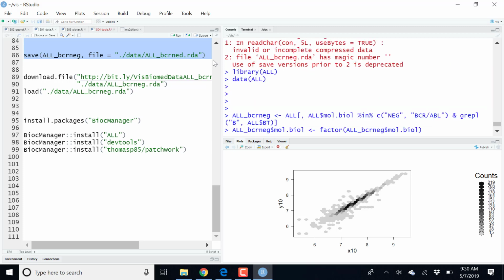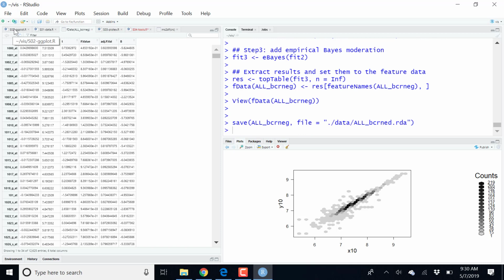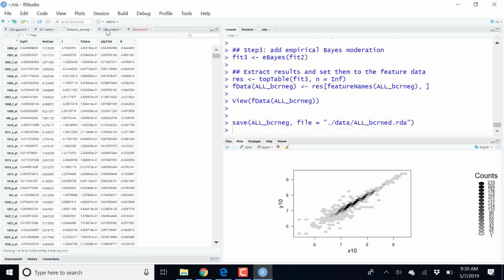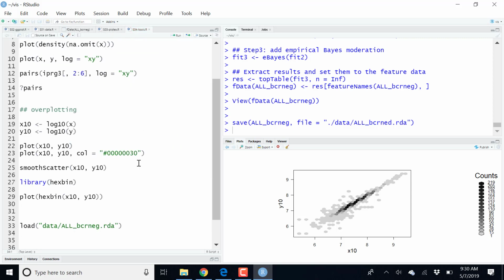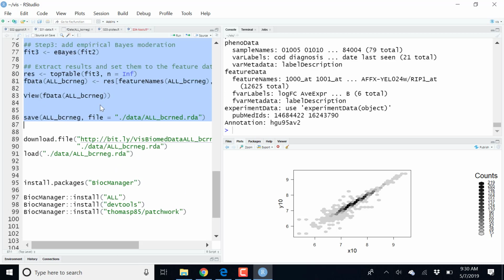Okay, I really seem to have a problem with my online data. Did anyone manage to load, for example, the ALL data that was downloaded? I have an error here when I try to do that. Well, if that also happens to you, it's easy enough.